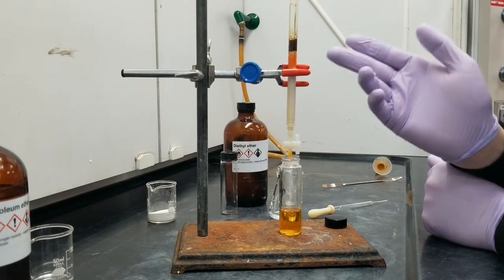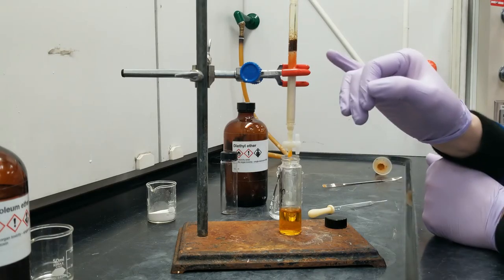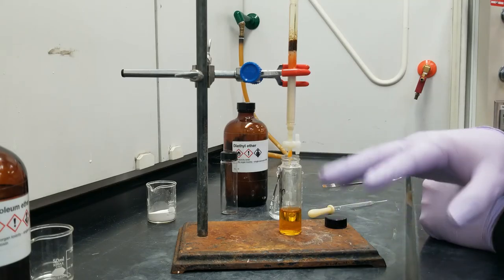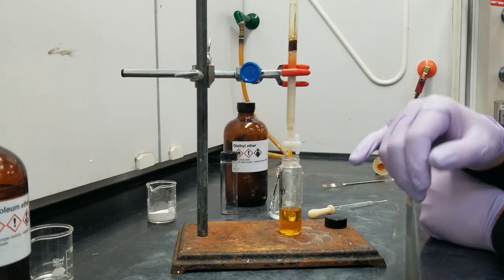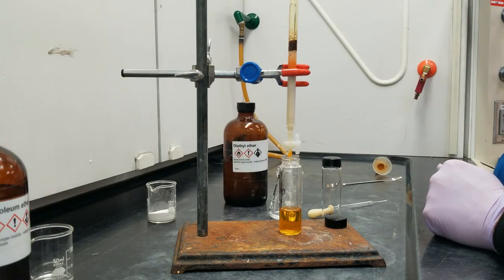So it's going to take a matter of minutes, at least, for the acetyl ferrocene to come down, so it's actually completely fine to keep collecting the last little remnants of ferrocene here as it gets pushed out of the system. I just need to be careful to switch to my acetyl ferrocene collection flask as this orange band starts reaching the bottom.